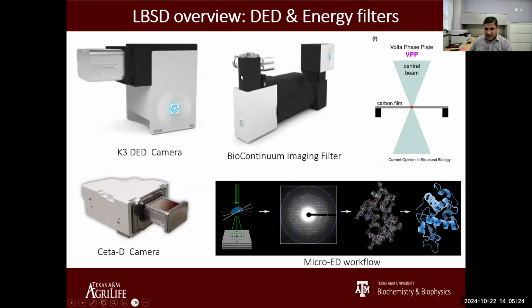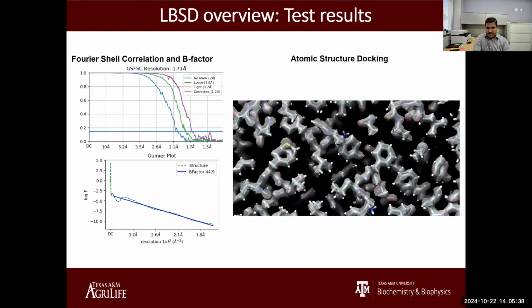We also have a BioContinuum imaging filter and phase plate. We also have the regular CCD camera, basically used for the microelectron diffraction work. Here is the capability, the highest resolution we got from our microscope.